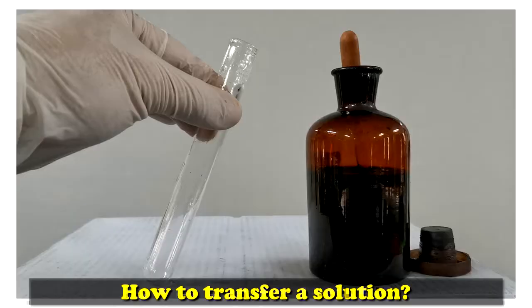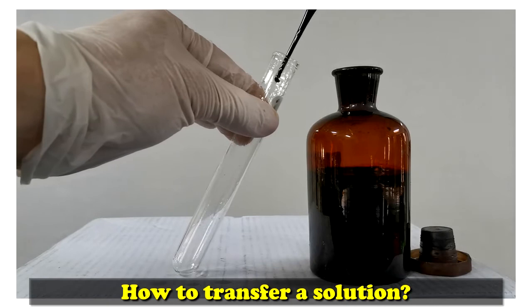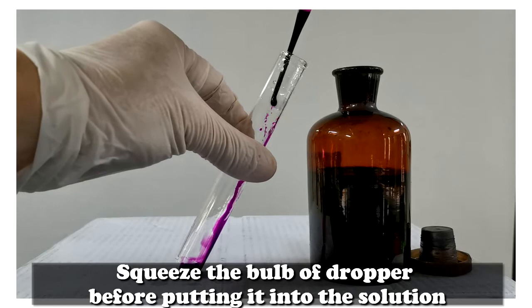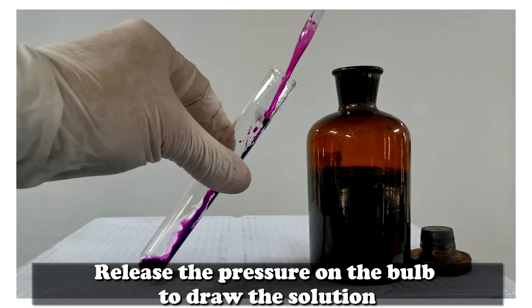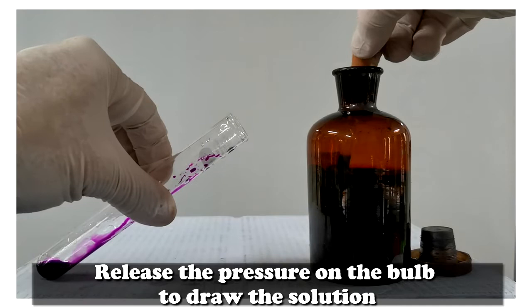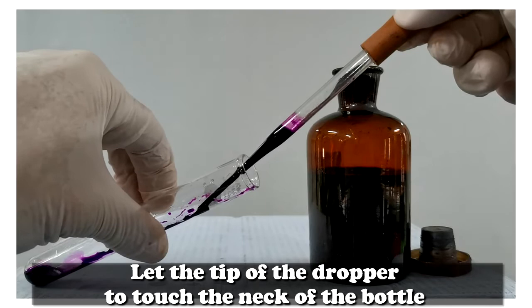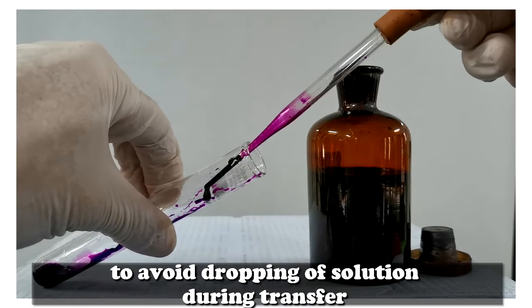How to transfer a solution? Squeeze the bulb of the dropper before putting it into the solution. Release the pressure on the bulb to draw the solution. Let the tip of the dropper touch the neck of the bottle. This is to avoid dropping of the solution during transfer.